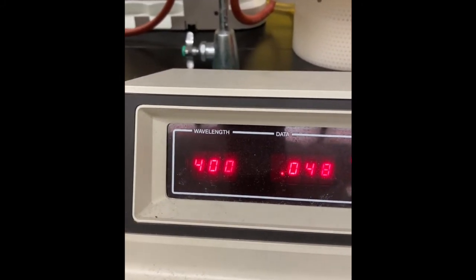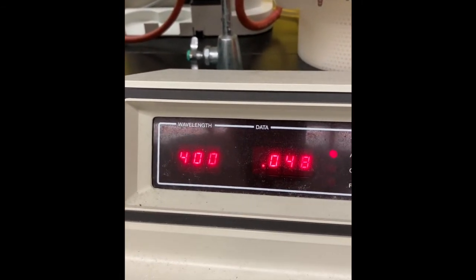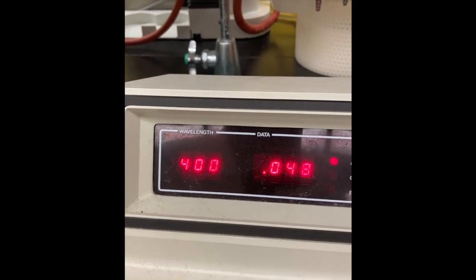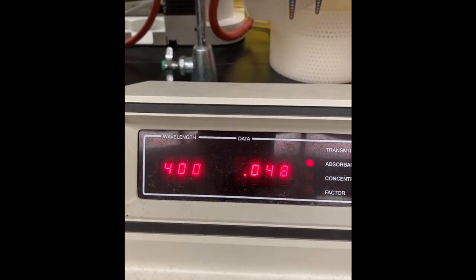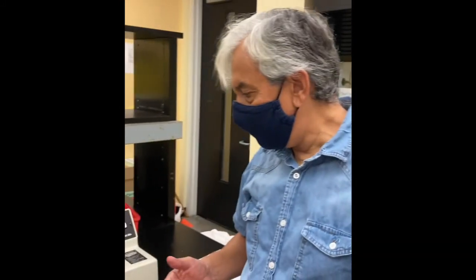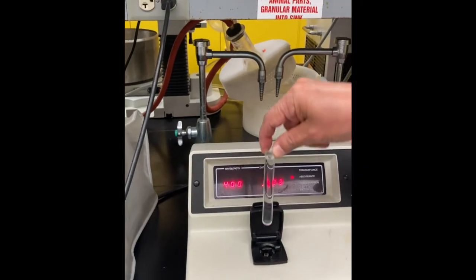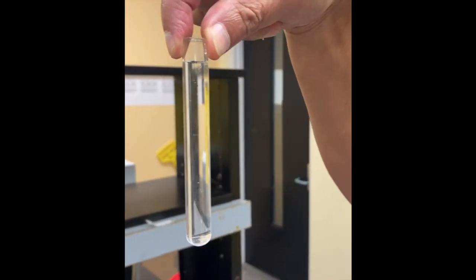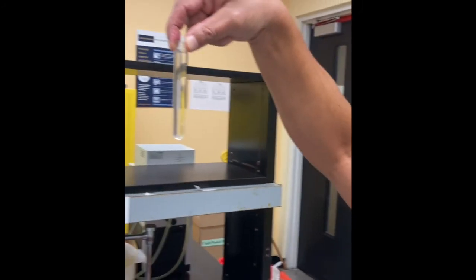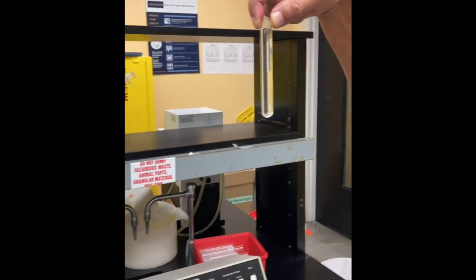Well, you can see that absorbance doesn't change anymore, which indicates that the reaction is completed, so we can stop our timer. Bromine, which was in the mixture, is fully consumed, and the reaction stopped because there is no more Br2 reagent. If we take out our cuvette, we can see that our solution is now transparent. The yellow color is gone, disappeared. So Br2 reacted to brominate acetone and disappeared from the solution.